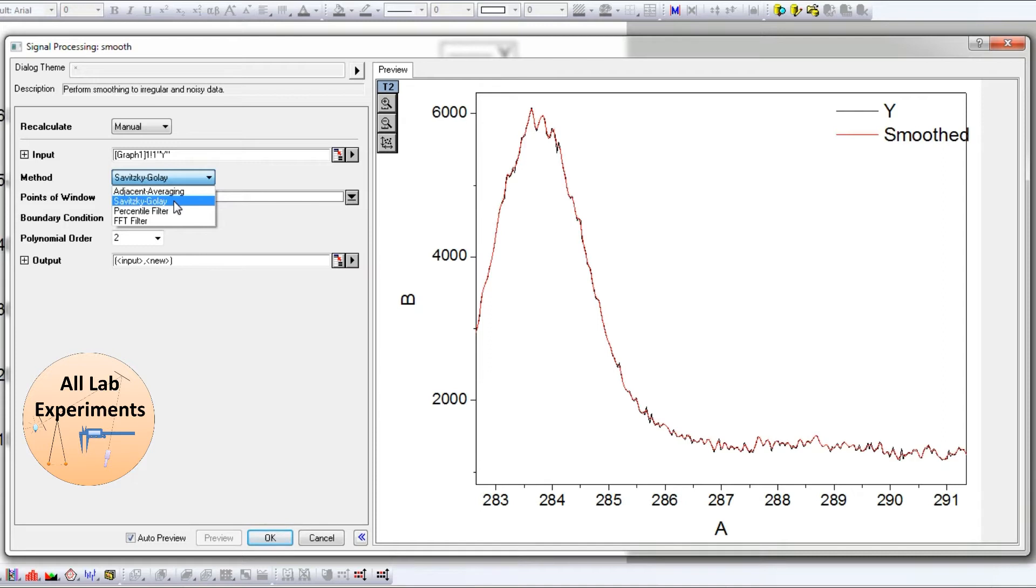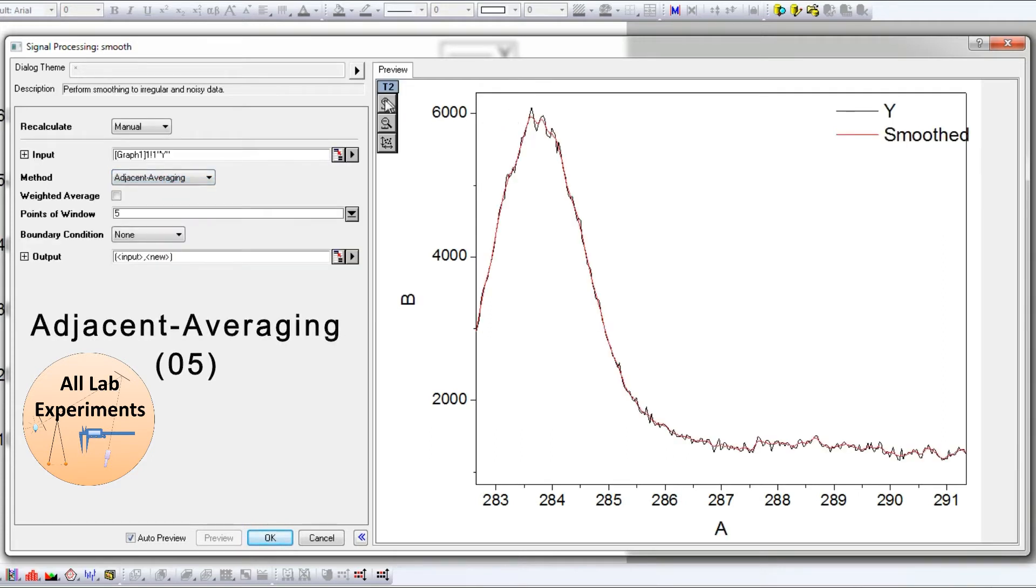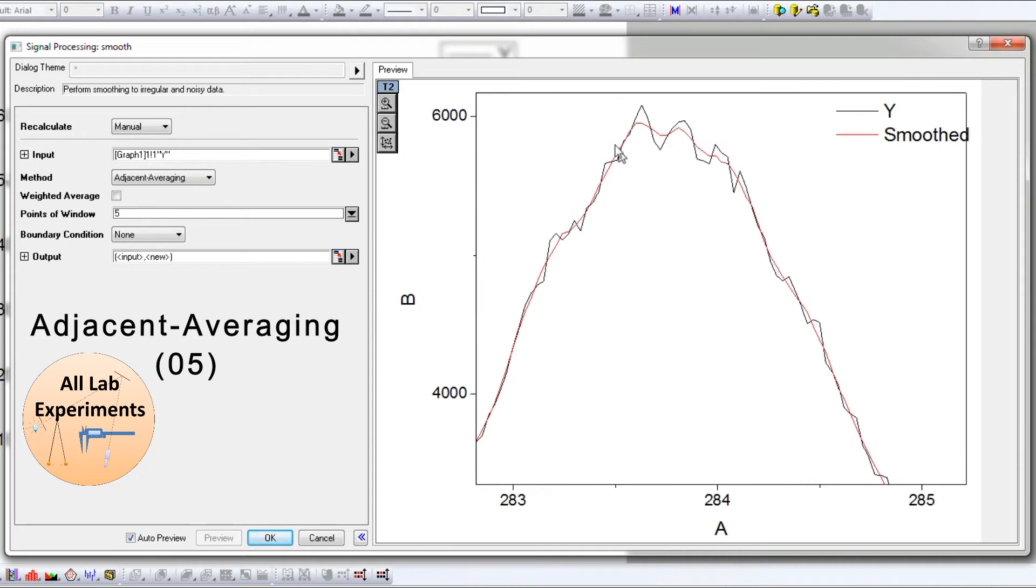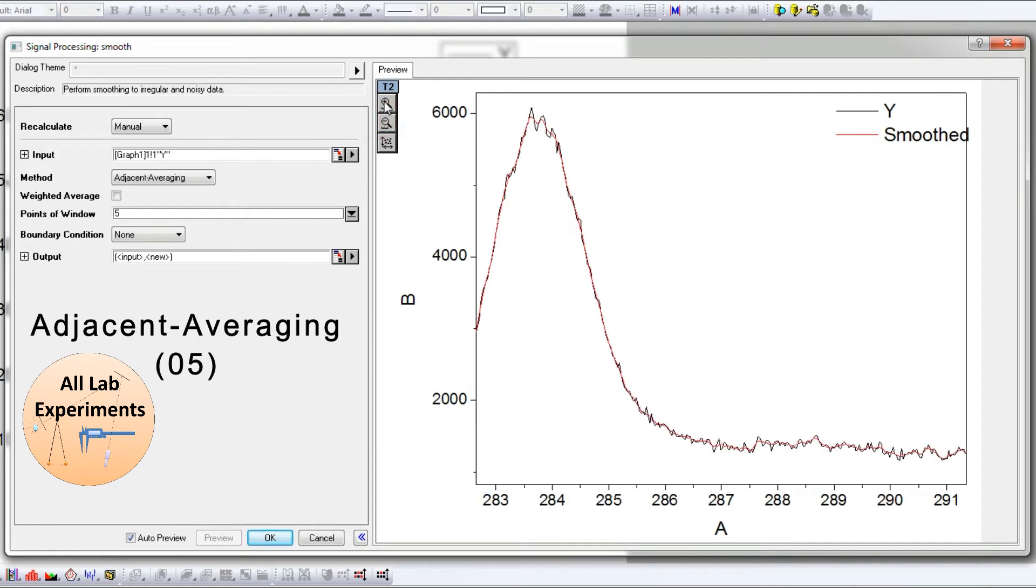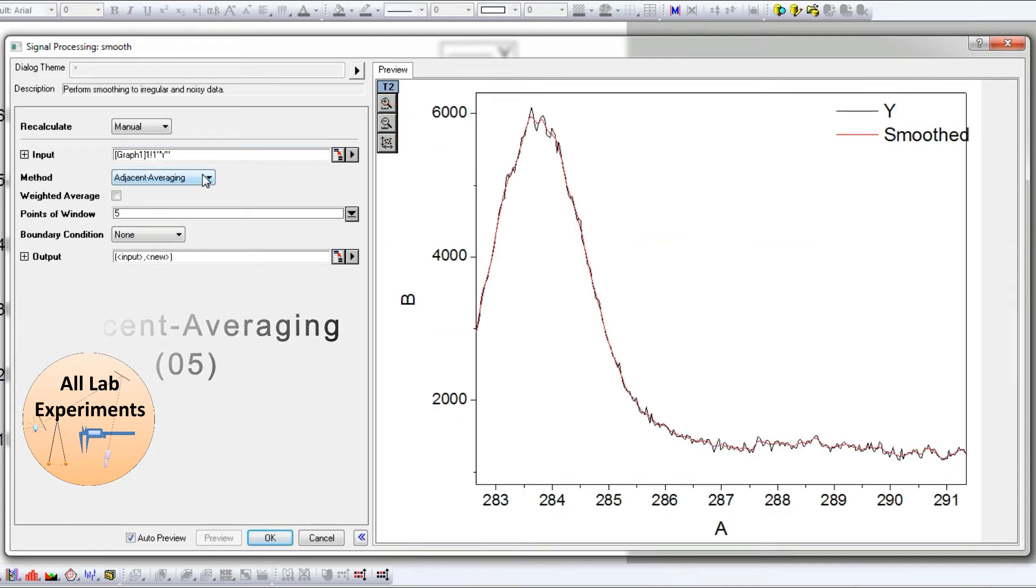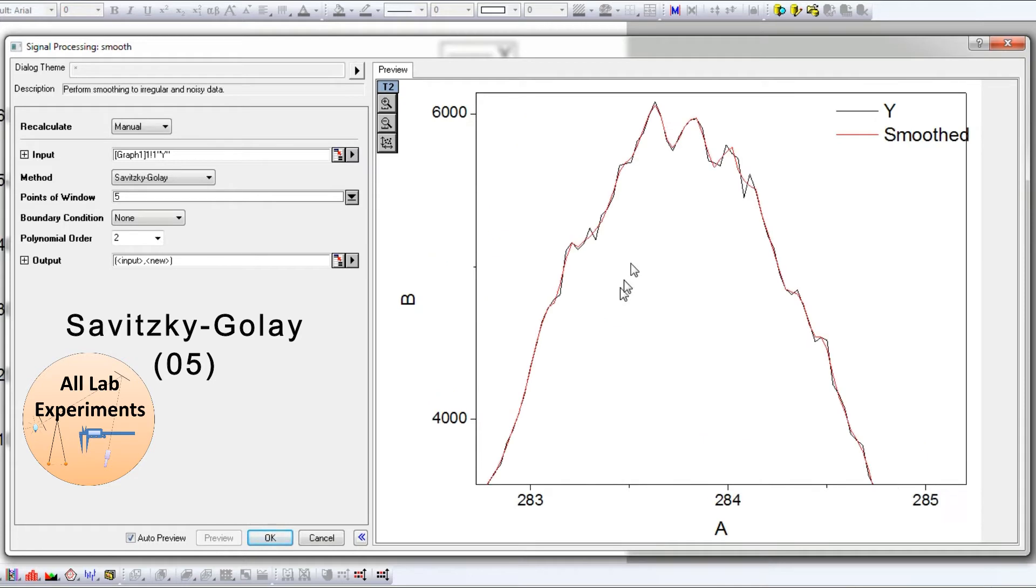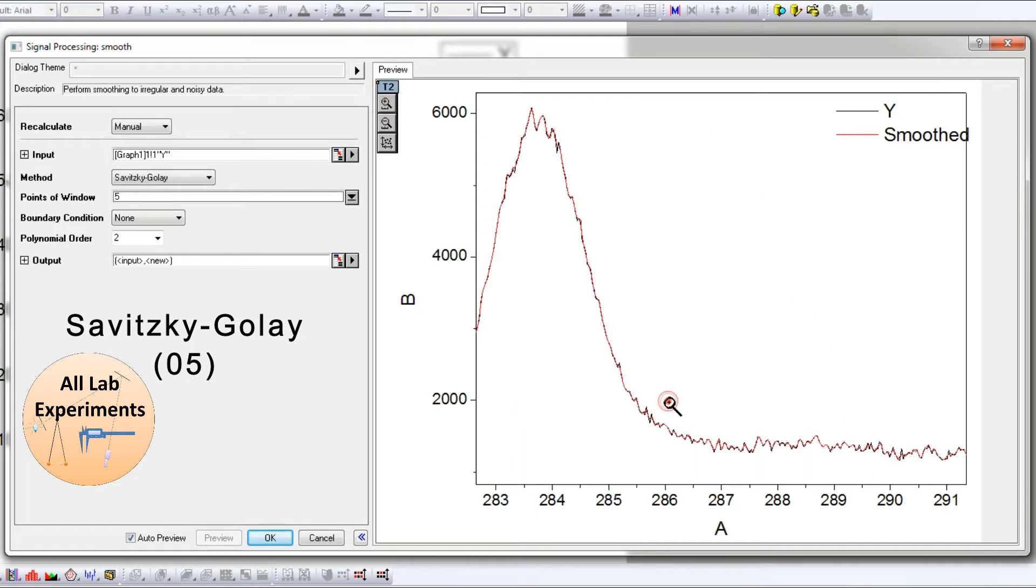That is the trickiest part you should learn. Let us start with Adjacent Averaging. We can see that this peak is getting a little bit smoother and this portion is also getting smoother locally. Now if I switch to Savitzky-Golay, the smooth data is almost the same as the original data.